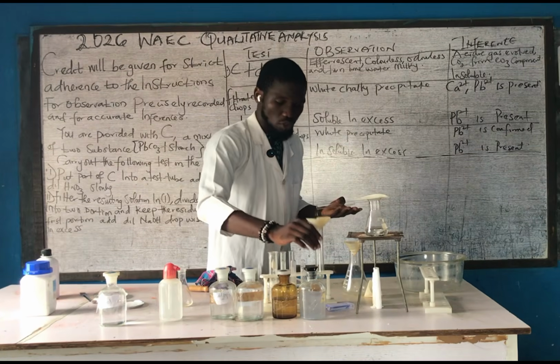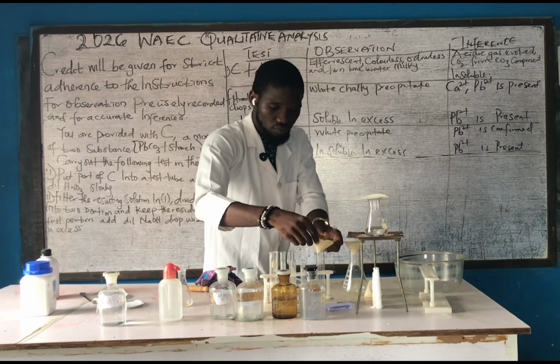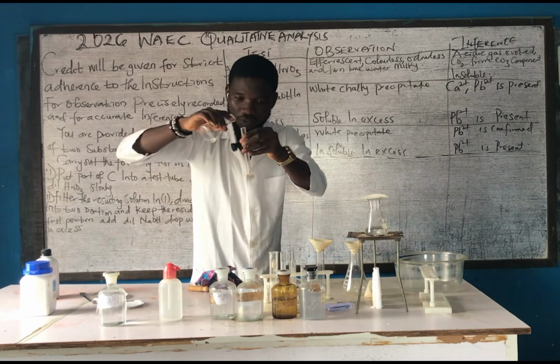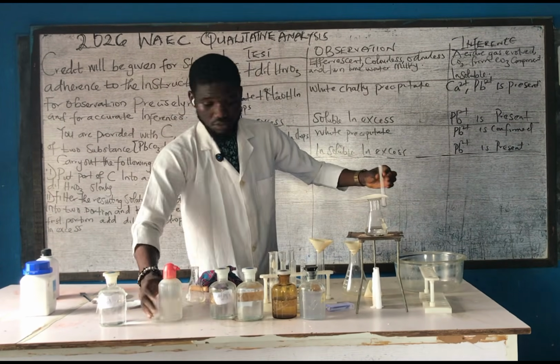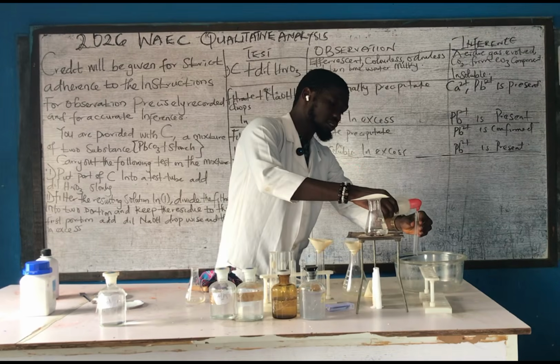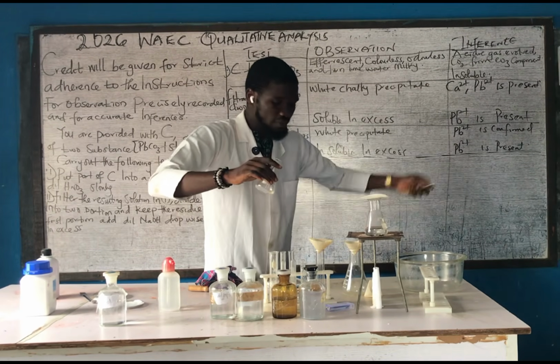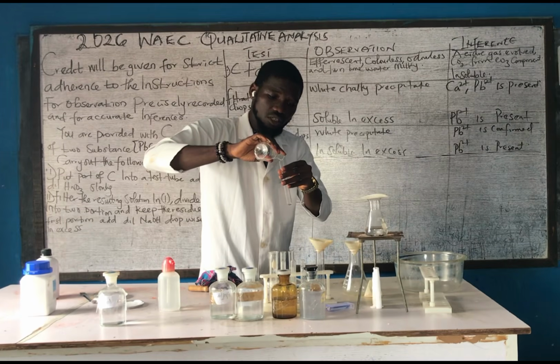Are you with me now? Be careful. Now this is my filtrate. Please, before you use any of these, always rinse it. So we have the filtrate.